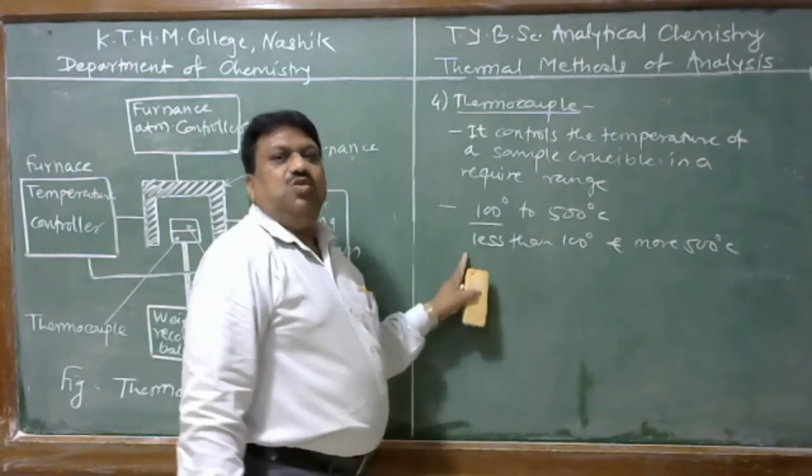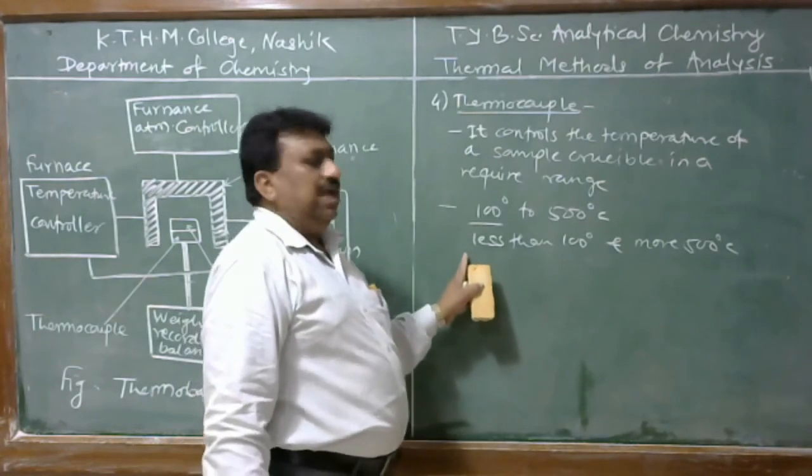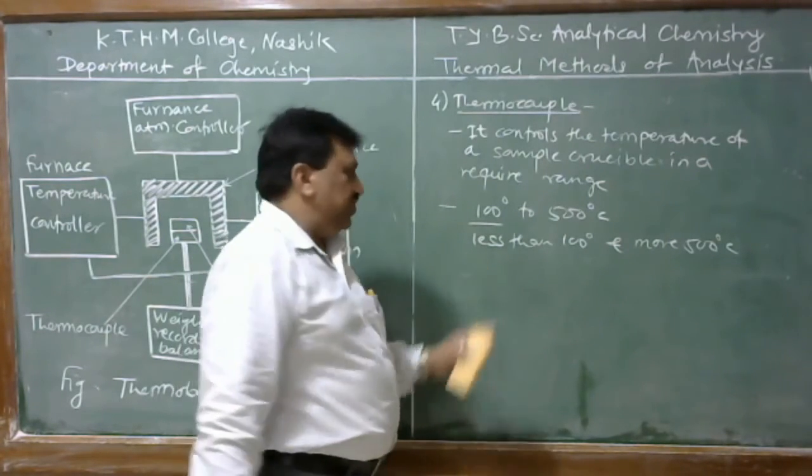There are different thermocouples applicable at different temperatures.